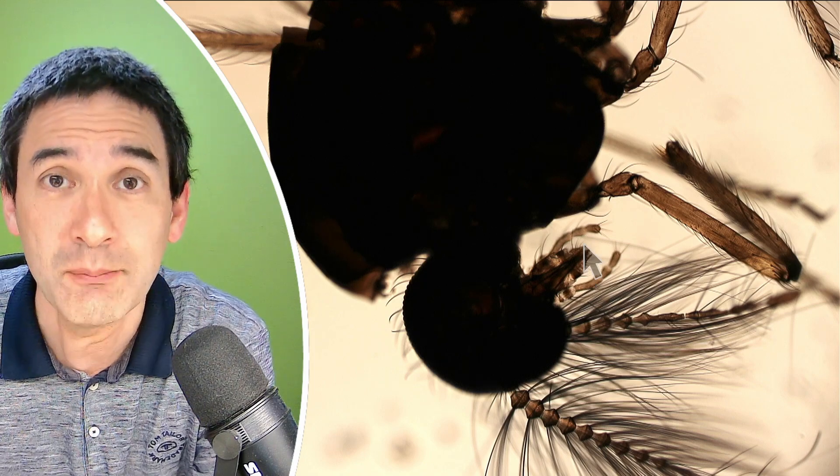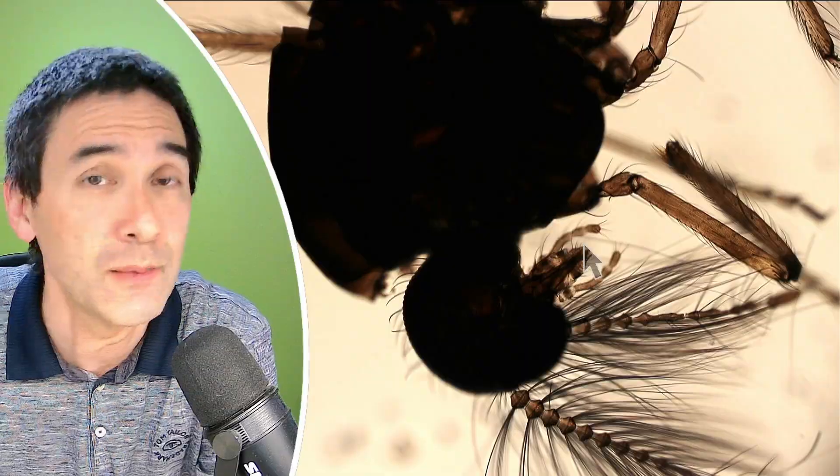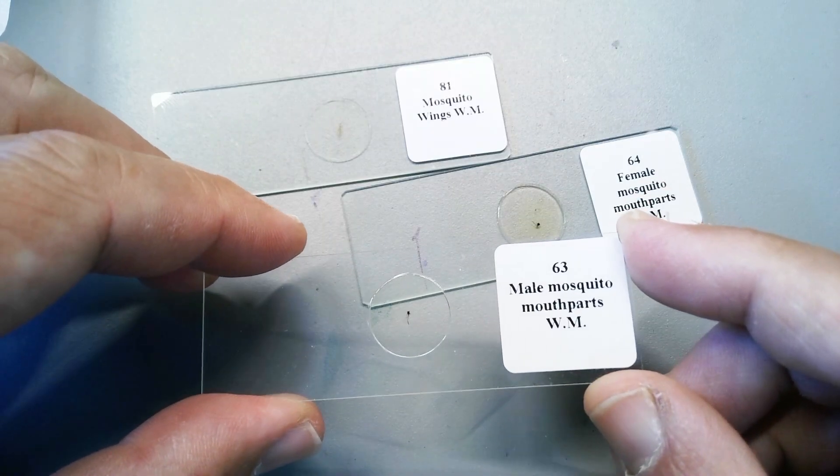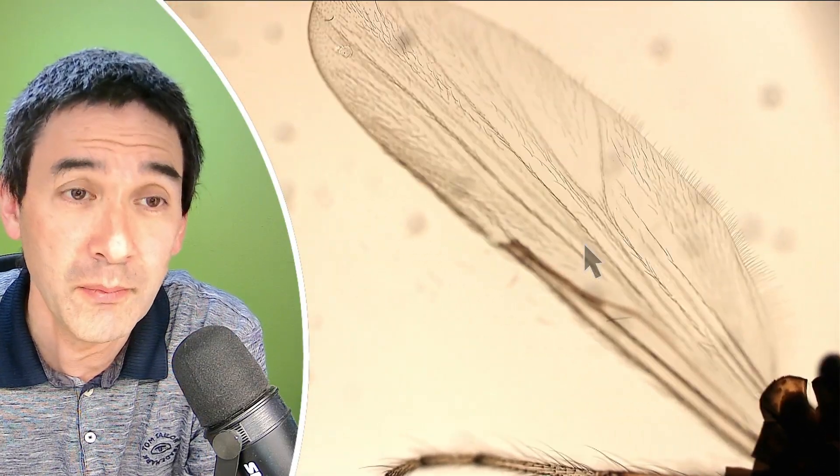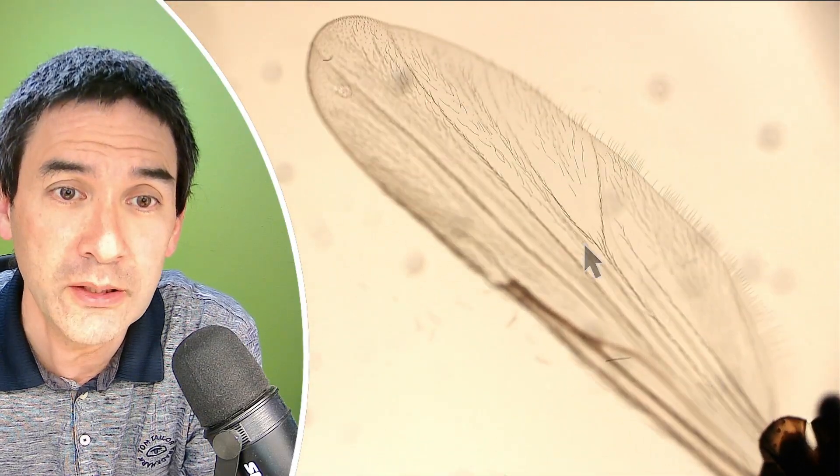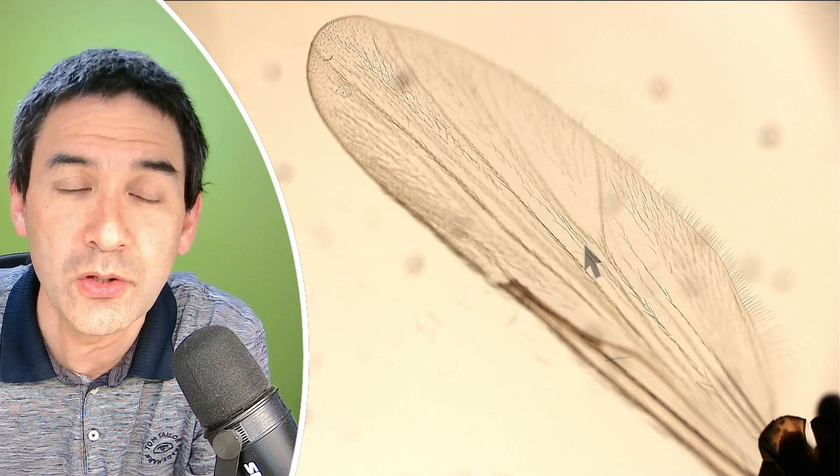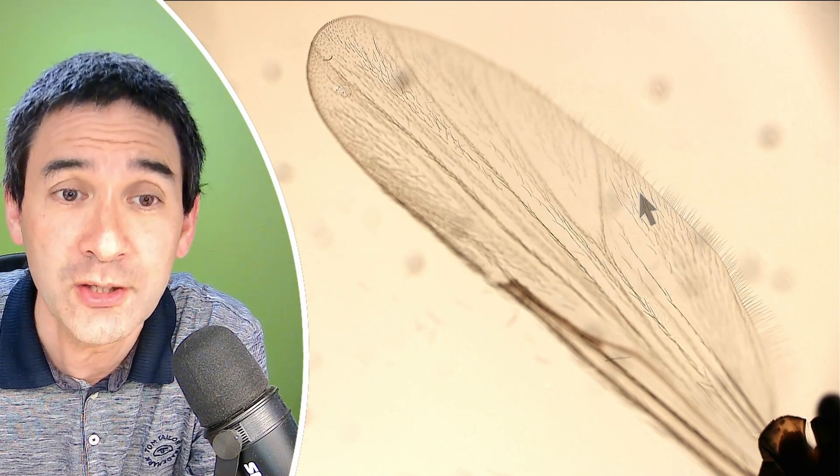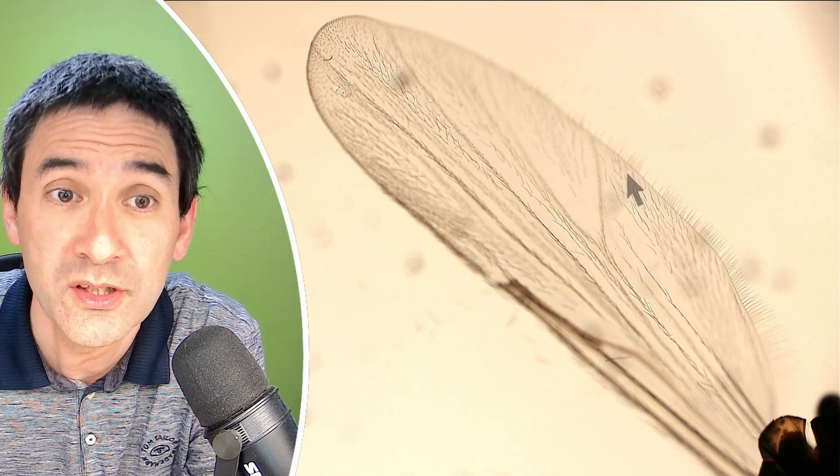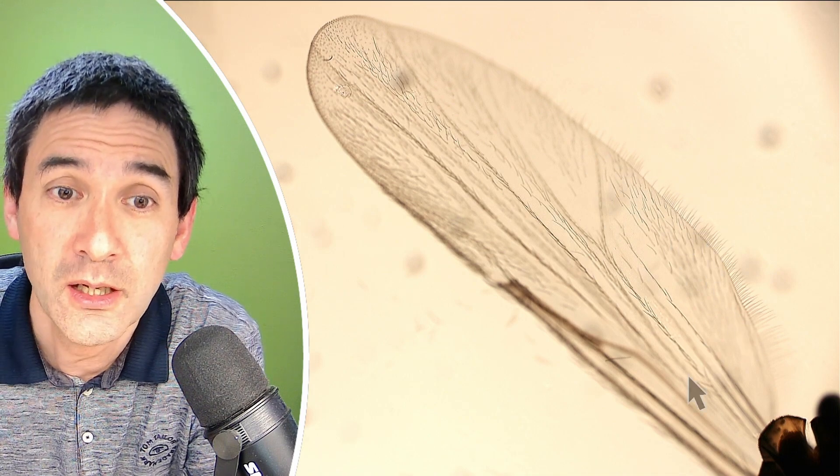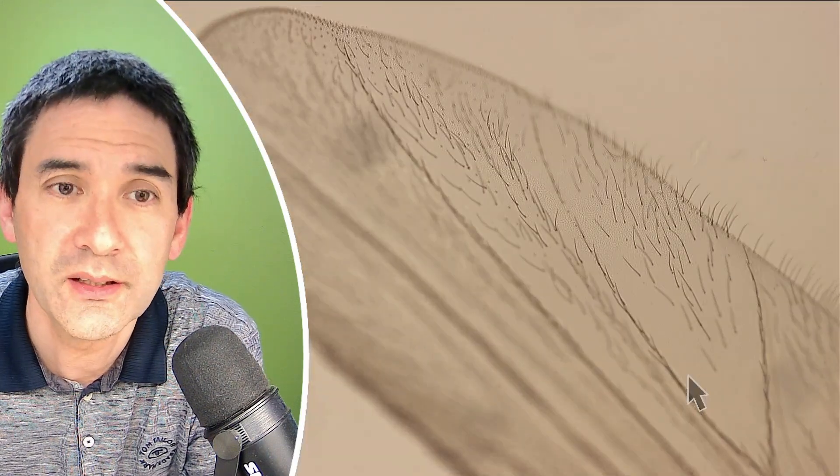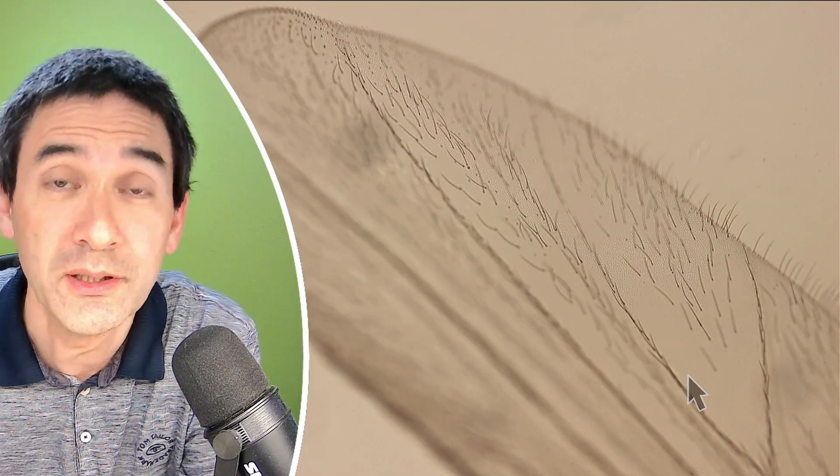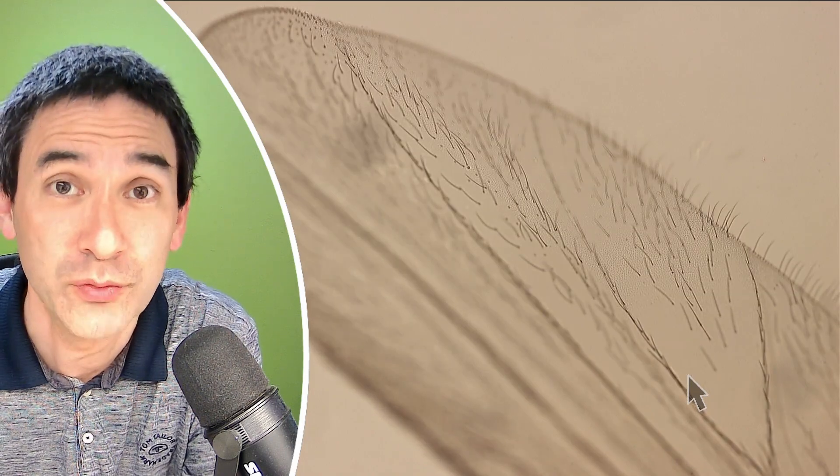And as a reference, I actually also have some other slides that I'm going to show you of some mouth parts of some mosquitoes. But that's not the only thing. If you look at the wings over here, the wings also did not quite look like those of a mosquito, because mosquito wings very often have scales attached to them. And what I have over here is basically only hair. Let's go in a little bit. You can see over here that it's covered with fine hair.